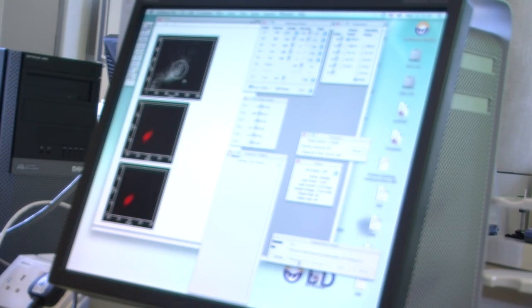You lose a little bit in terms of the morphology of the cell itself, the colonies, or even the cell morphology because they become round. Okay, but you still get the labeling done because you have the cells, even if they are in suspension like these ones, so you still have everything attaching to it. It's just in terms of the morphology that you would usually get. But that is something that you can discuss afterwards when you do your reports.